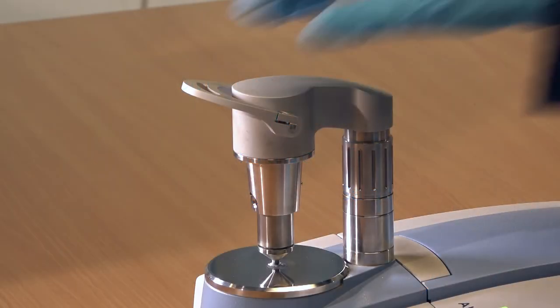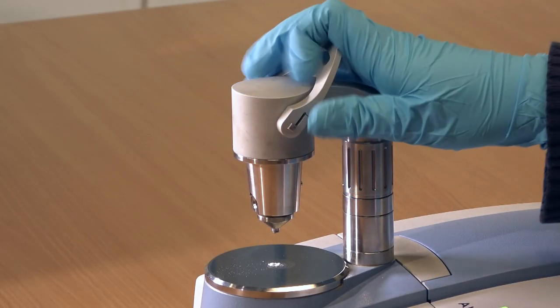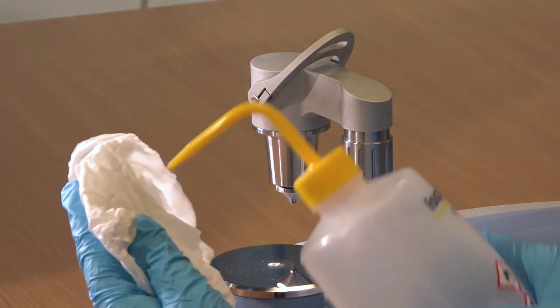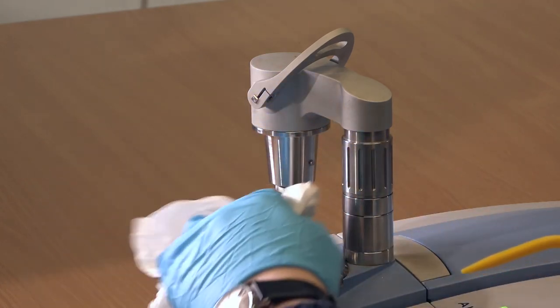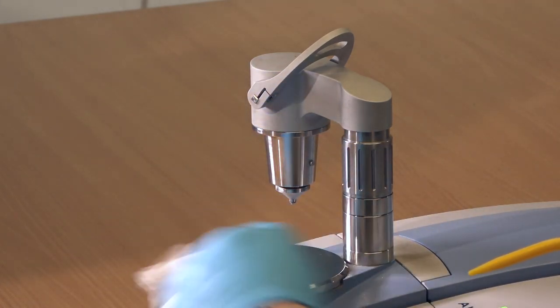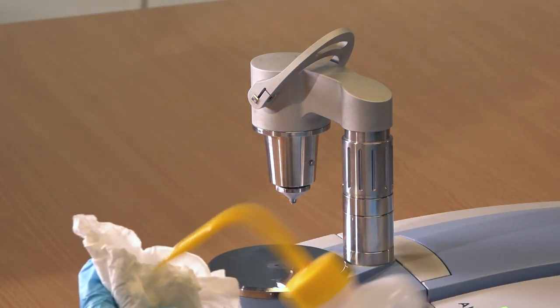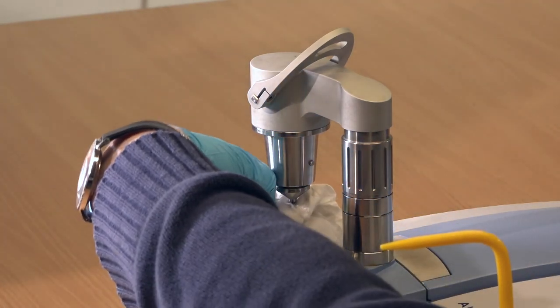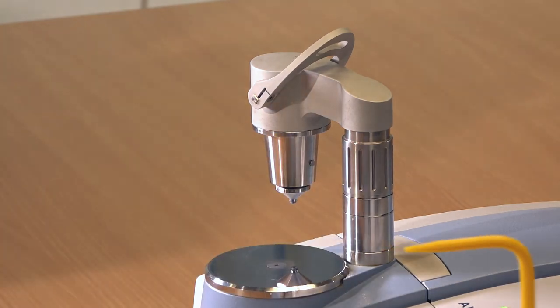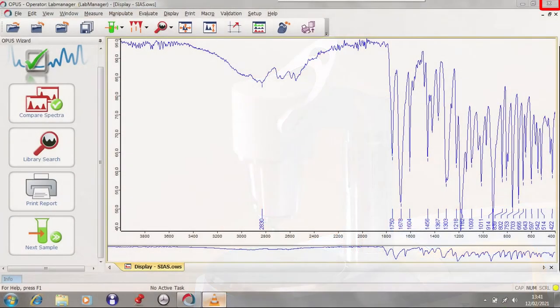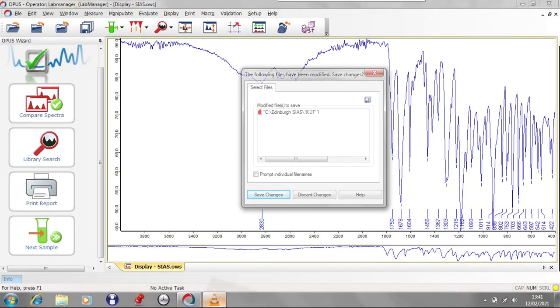When you're finished with your samples and saved everything, clean down the plate and arm with IPA and a tissue as shown, and then close the laptop down.